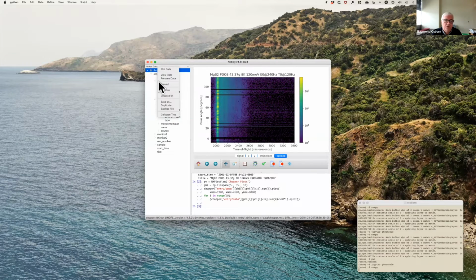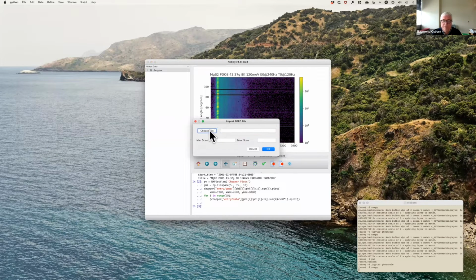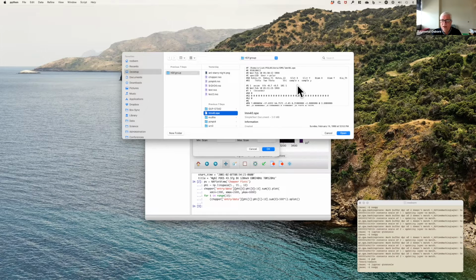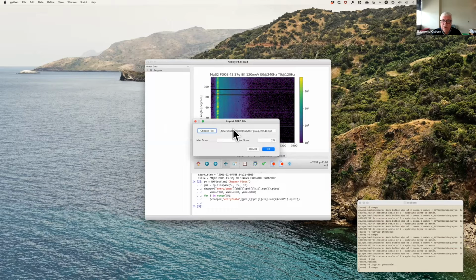And then I think the other thing I wanted to do was to show that you can import data from other sources. So we have a number of import readers. Here's the one for importing spec files. Now, X-ray scattering friends will know exactly what spec is. It was formed at one time as sort of a de facto standard for running scans, using these sort of multi-column outputs for each scan. And so we're using Spec2Nexus that Pete Jemian at Argonne wrote, and it immediately parses the data, shows 271 scans. I'm going to just import 20 of them.